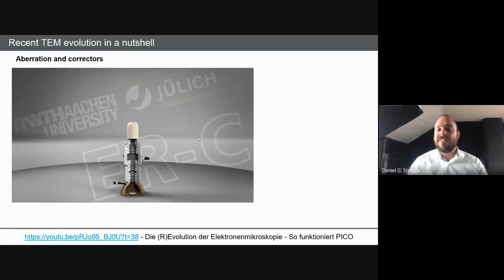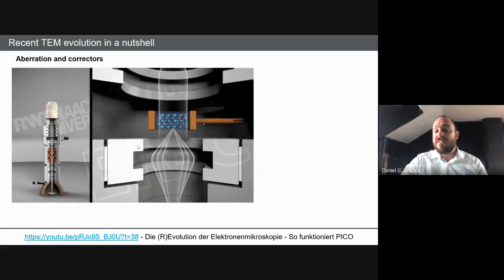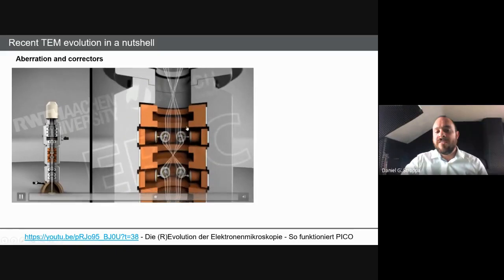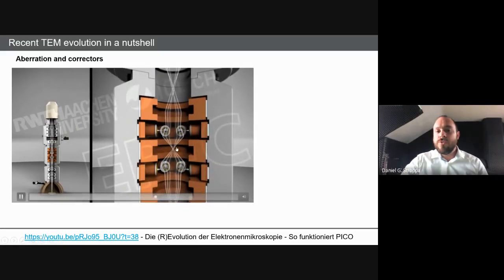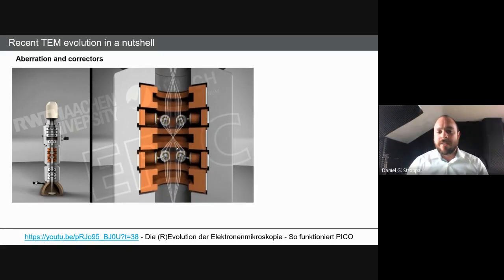And here, without going into too much detail, the spherical aberration is a tricky one to correct in regular light optics. What you do is use a divergent lens to do that. But when you're talking about an electron microscope, you cannot use a divergent lens individually. It's just not allowed by the electromagnetic lens design. And the way to do that is to break the symmetry using multipoles.